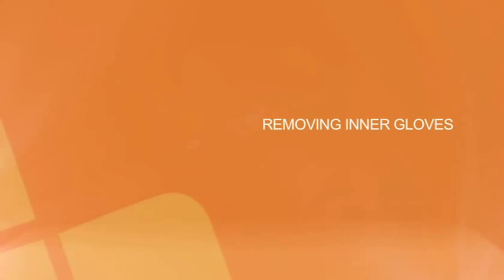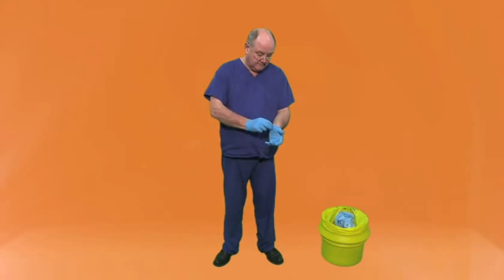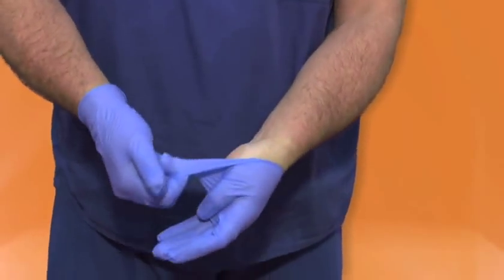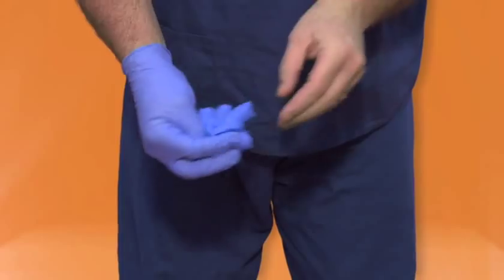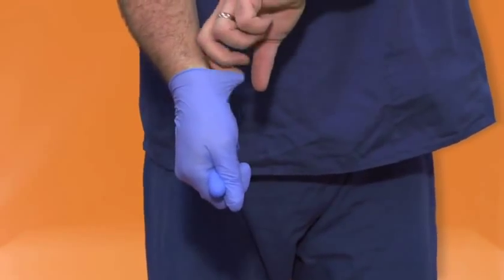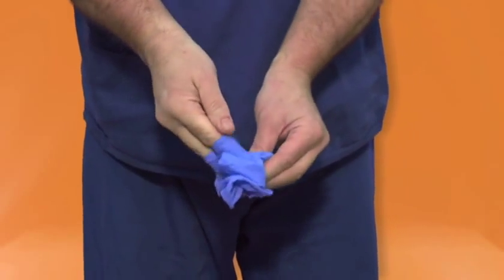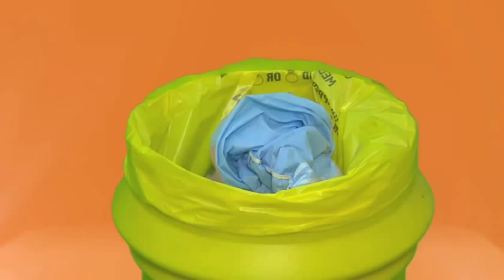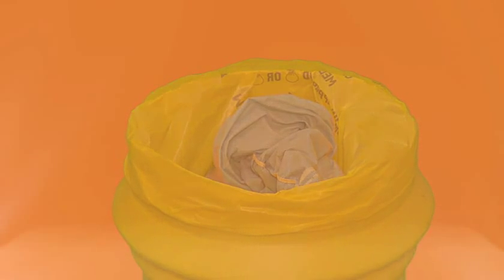Remove the inner gloves. The outside of the glove will be contaminated. Grasp the outside of the glove dirty to dirty with the opposite gloved hand. Hold the removed glove in the gloved hand. Slide your finger into the inside of the glove clean to clean. Peel the gloves off so that they are turned inside out and dispose of as clinical waste in a yellow bag.